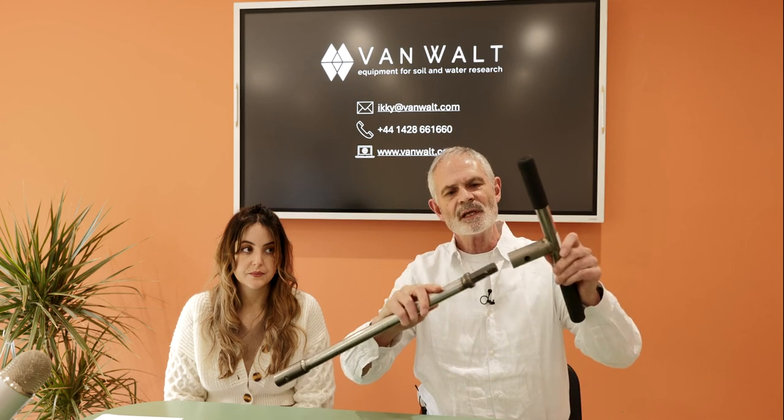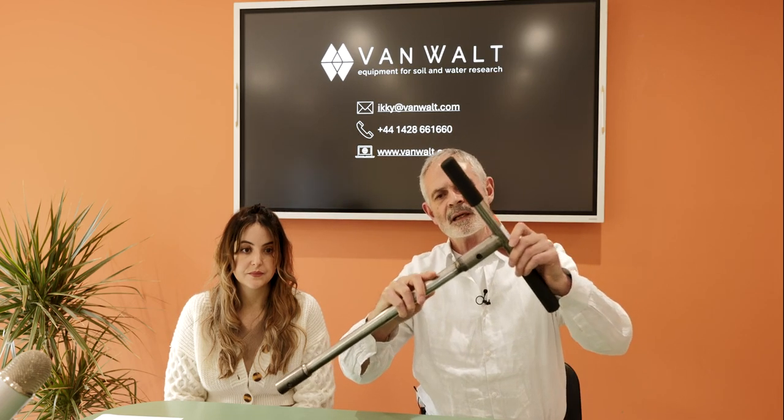And the connection type that we use, we call it a hex quick pin. You may not see that very well on camera, but it's a hexagon. And the devices slot into each other like that. So all the forces when you're turning are not on threads, for example, which can get very, very difficult to undo. The connection is quite simple.